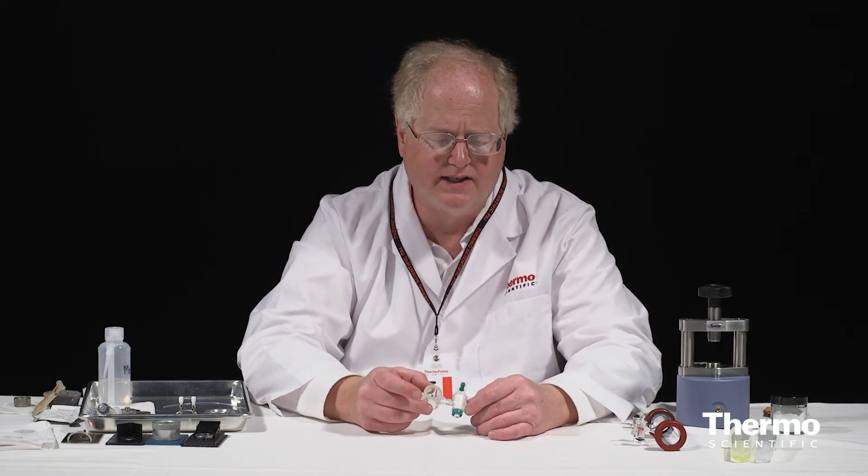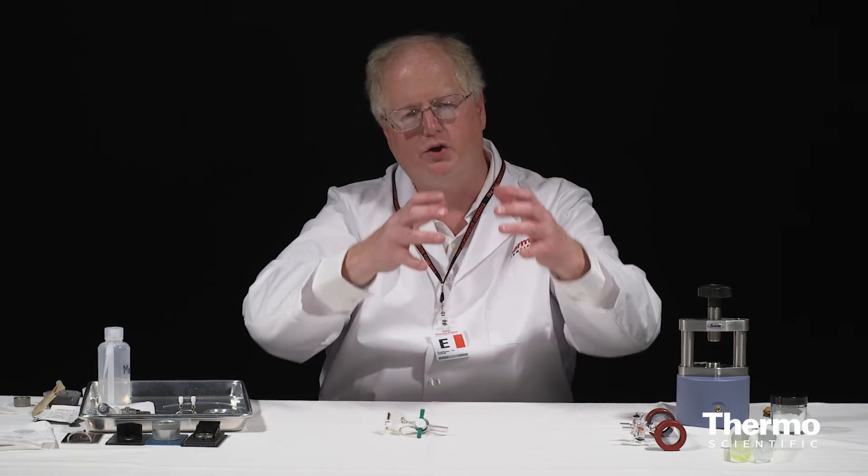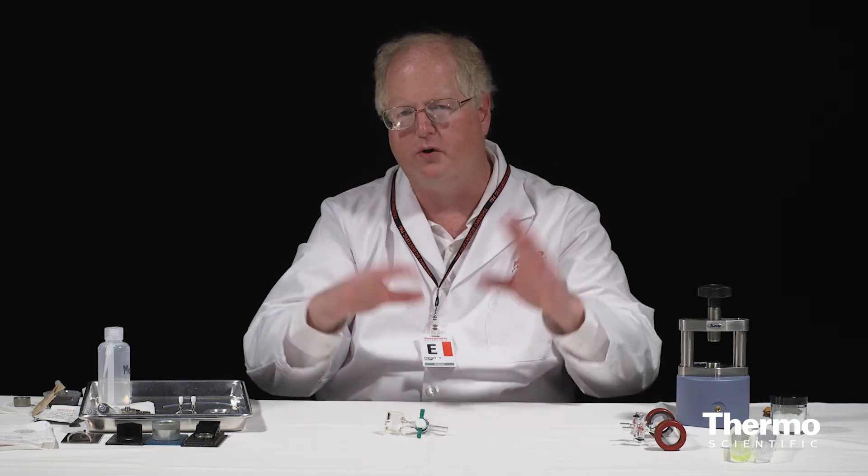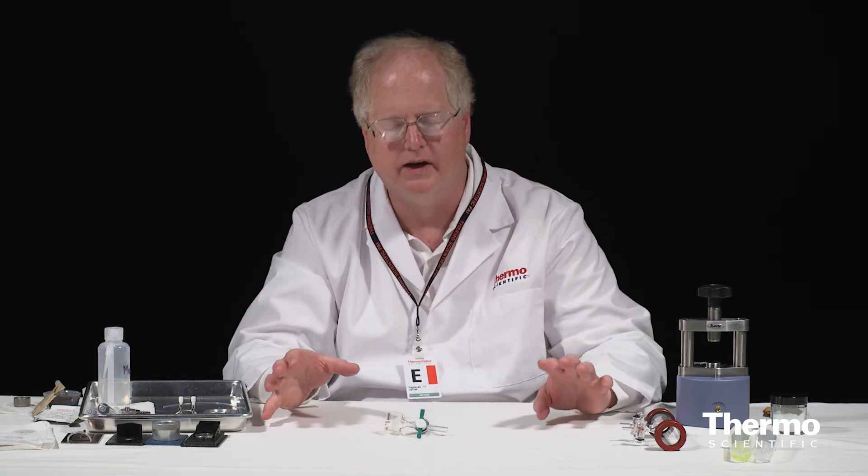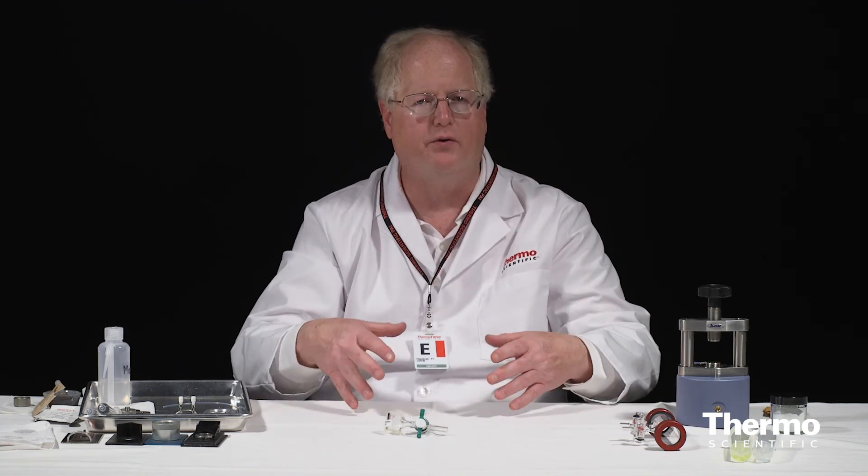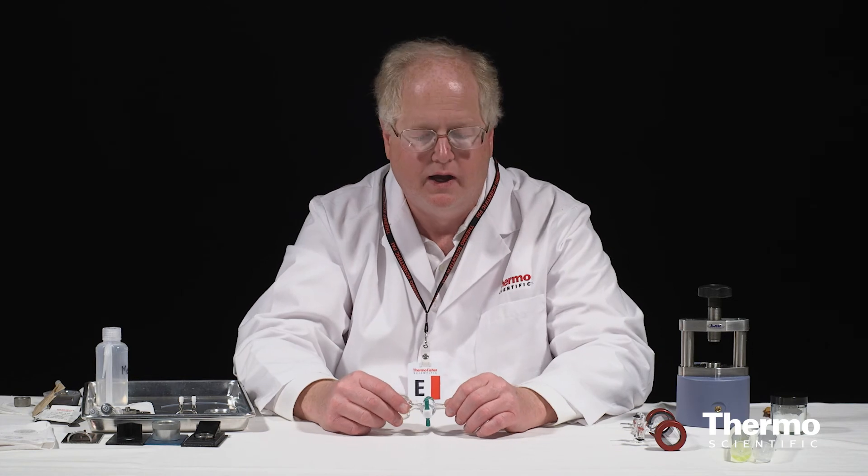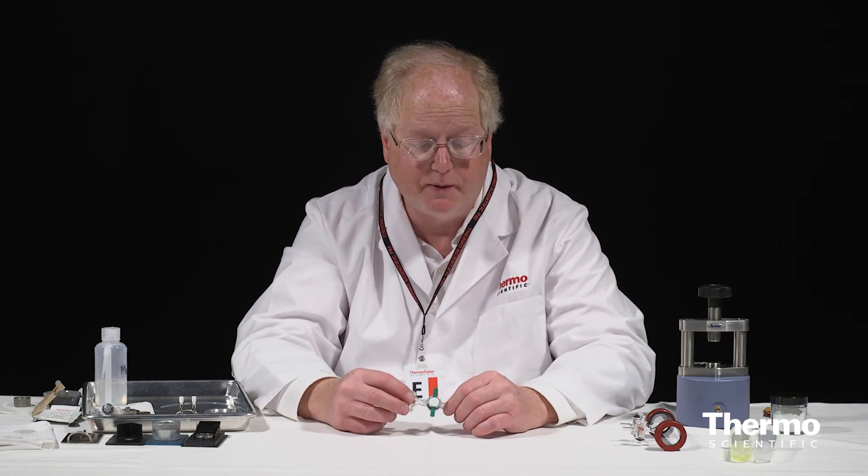So that's it for the gas cells. You can get gas cells that are very large, like cylindrical pieces of stainless steel, that have 2-meter, 3-meter, 50-meter path lengths, depending upon your application and the sensitivity you need, with different interior walls and different adapters for different spectrometers. It really just depends on what you're going to do.